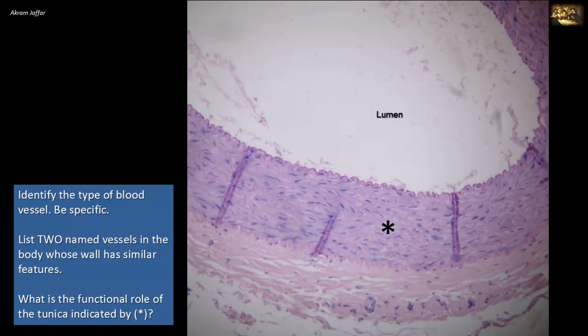This slide shows the basic three components of the wall of a blood vessel. Also, tunica intima, although the endothelial lining and subendothelial connective tissue is not clear in this magnification. But the internal elastic lamina is a prominent, densely staining, wavy line at the junction with the tunica media. Then the tunica media, which is made up of smooth muscle cells, concentrically arranged, as you can see here in this section. Elastic fibers, some of them are sparsely seen. And most of the connective tissue fibers in the tunica media are collagen fibers. The outer layer is the tunica adventitia, which shows collagenous connective tissue separated from the tunica media by an external elastic lamina, another dark stained wavy line.